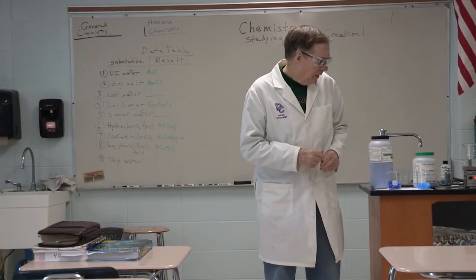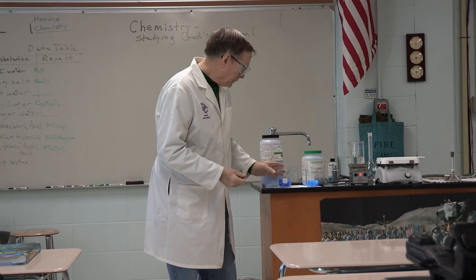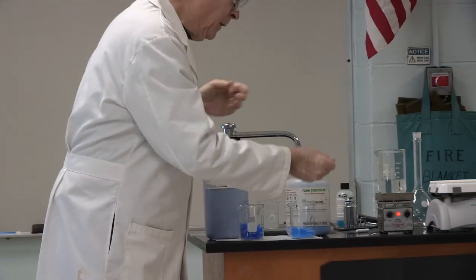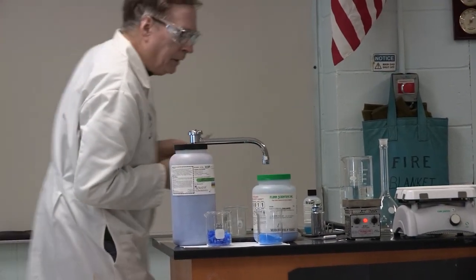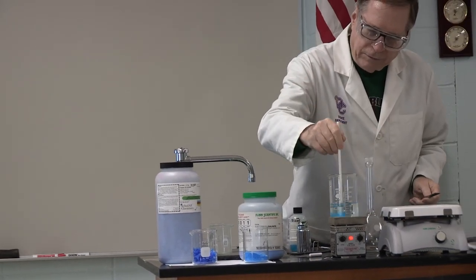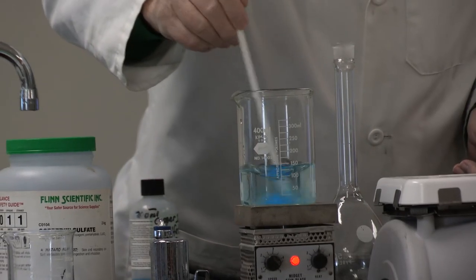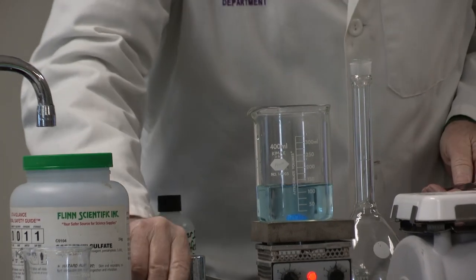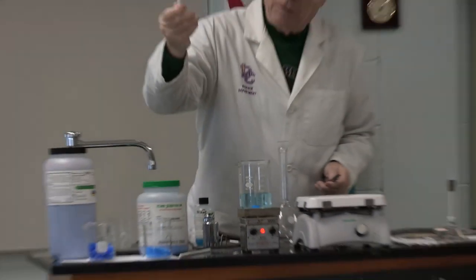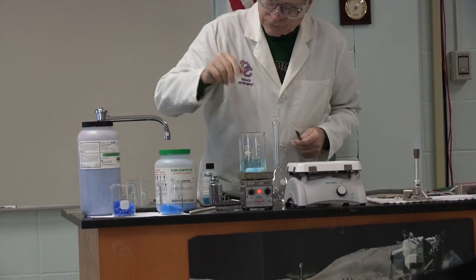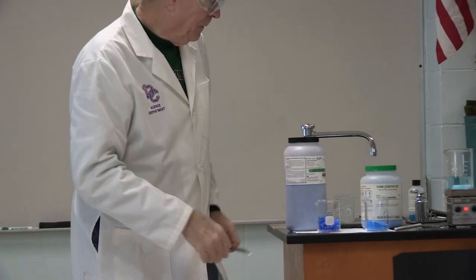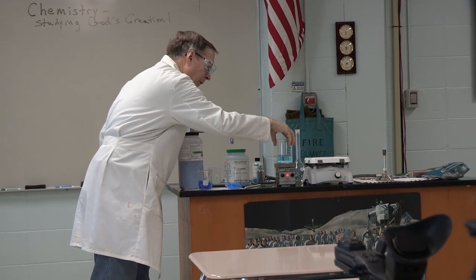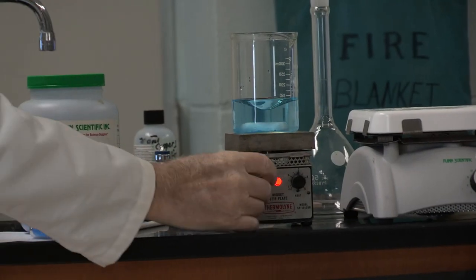The next thing was stirring. I'm going to add some crystals — normally I would weigh out the exact amount I want, but for this demonstration I'm just going to put some in. I'll get my stirring rod here and start stirring. But I don't really want to stand here and stir this, because it's going to take about a half an hour for it to go into solution. So I have an easier way to do it. I'm going to take this stirring bar and put it in here on the stirring plate. That stirring bar is actually a magnet, and I can turn this motor on, which controls another magnet in the stirring plate, so I can let the stirring plate stir that for me.